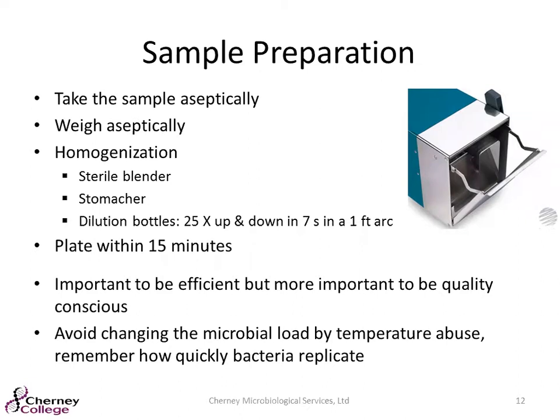We also recommend, once the diluent is added, plating within 15 minutes. Bacteria are going to start to replicate after roughly 20 minutes. So once that diluent is added, the clock starts ticking, and you want to get a true representation of that original sample. So you really want to get those plated within that 15-minute time frame.